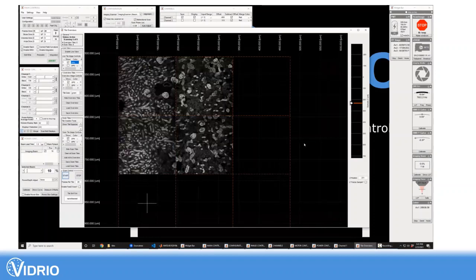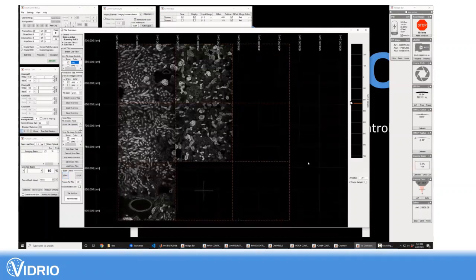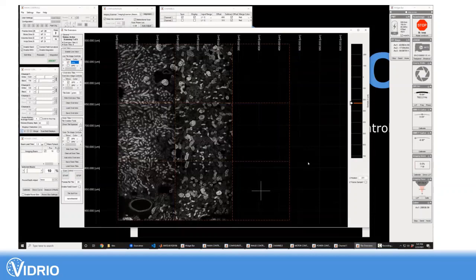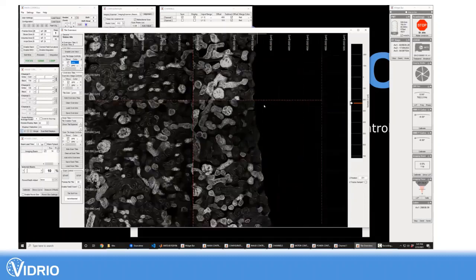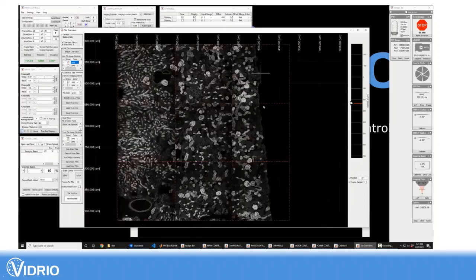this year, probably in the first half of the year. And we're pretty excited about it. You have to have good stage alignment and good stages to be able to do this. So you get really nice, well-aligned segments, but it's a feature that people have really sort of wanted and demanded.